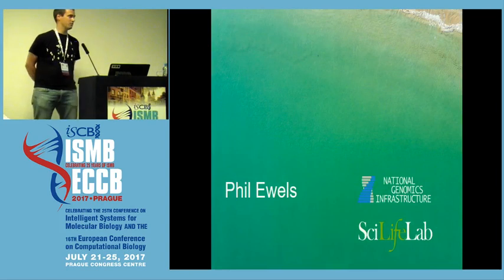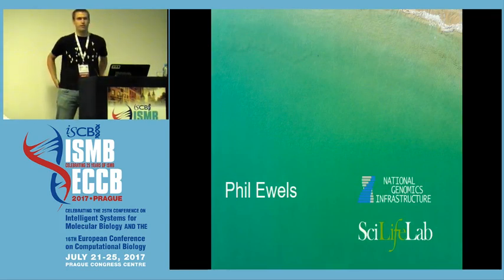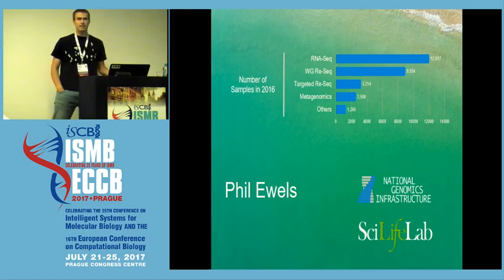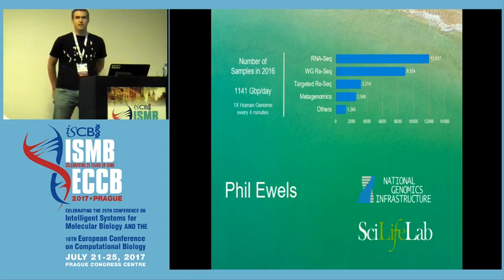I work at the National Genomics Infrastructure in Sweden, which is kind of like a core sequencing lab, but for the whole country. It's part of SciLife Lab, and users come to us with projects, and we do the library prep with sequencing and some bioinformatics work for them. We're a fairly big centre. We've got quite a lot of machines, and we process thousands of samples every year. There's a lot of sequencing data, and we have to perform quality control analysis on all of these samples before sending back to the user to make sure that nothing's gone horribly wrong, basically.